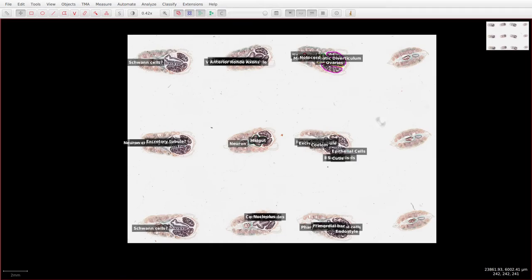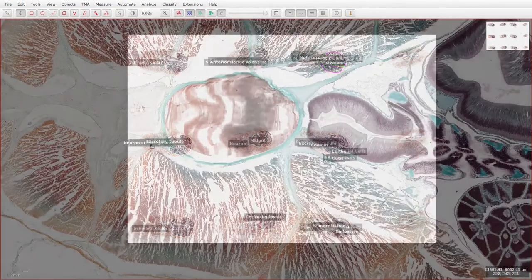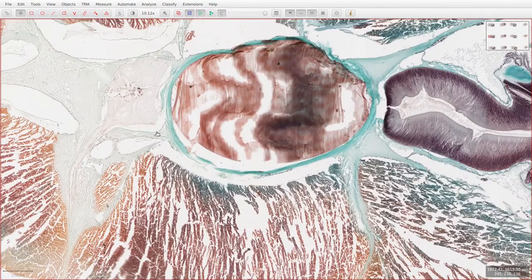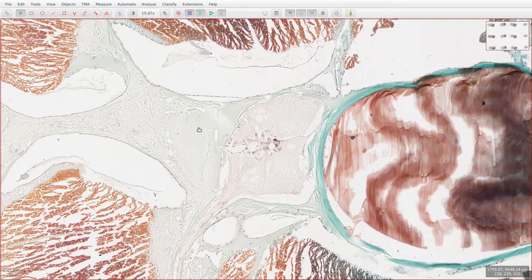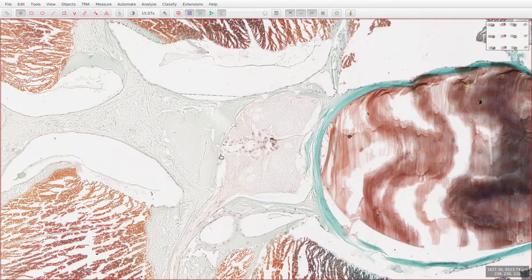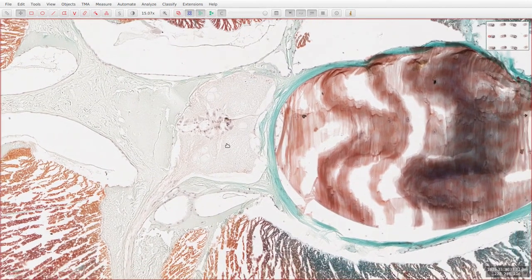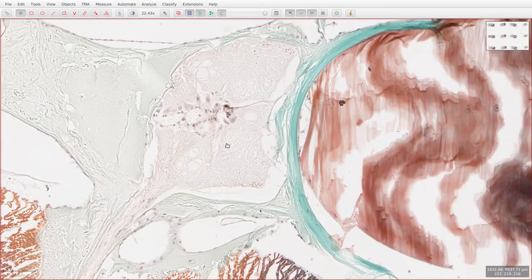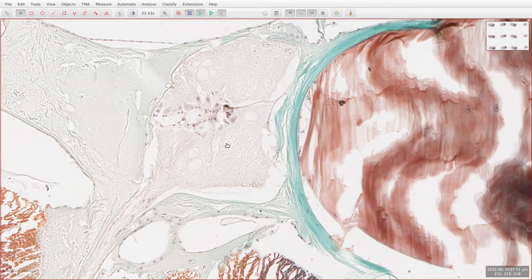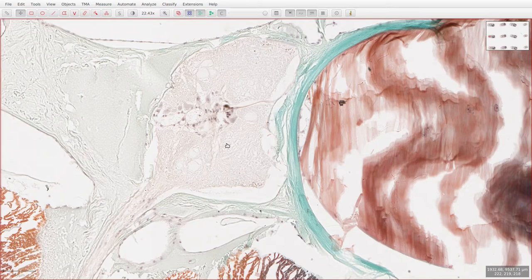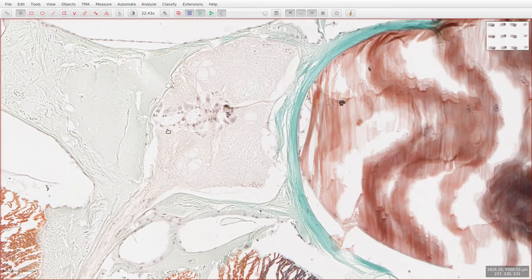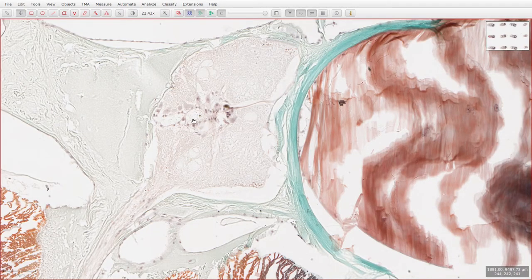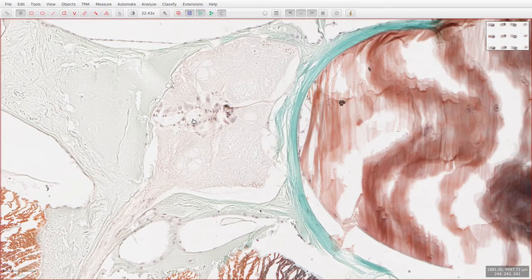So zooming in on the dorsal spinal cord on this section, we can see that there are two overall types of cell within the central nervous system. Those consist of the glial system which is there to support, and the neurons which form the actual nerves and axons which go to the peripheral nervous system.